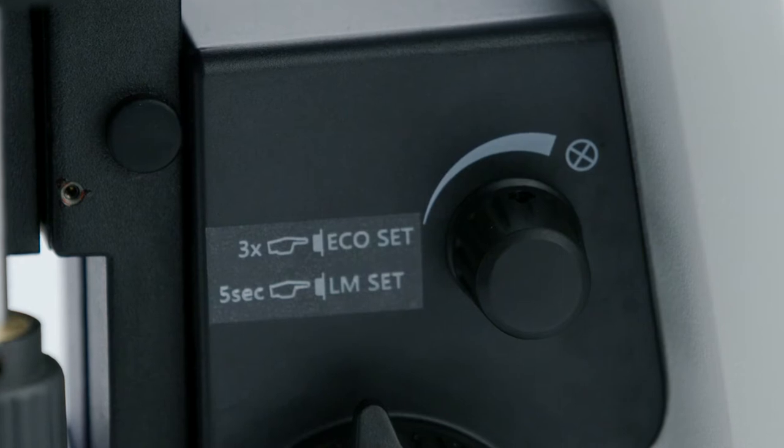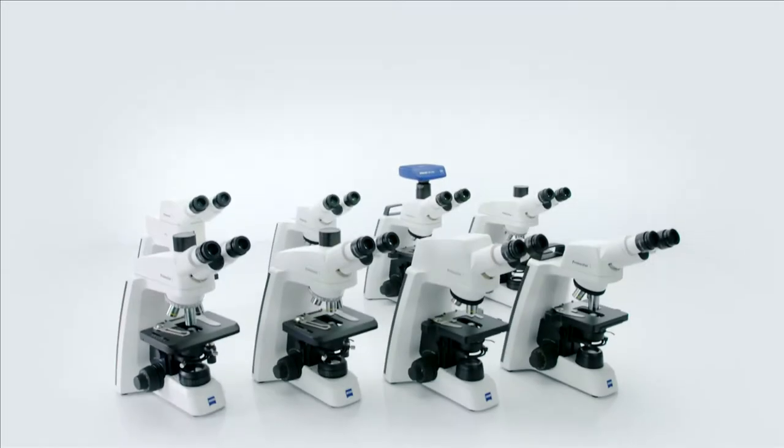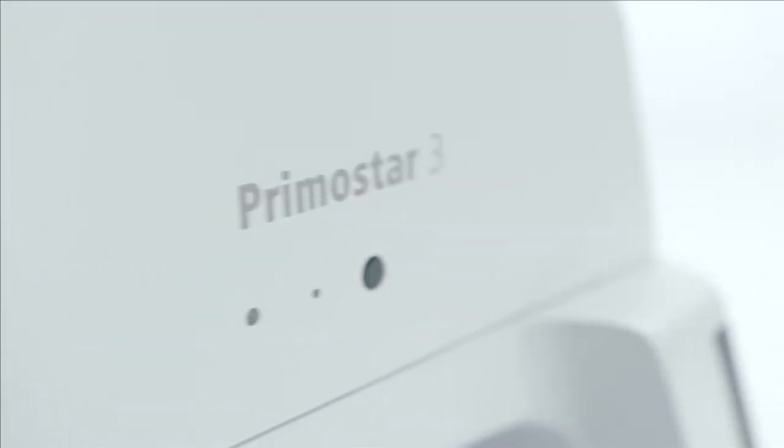Simply activate the Light Manager when changing lenses and the microscope will remember the precise amount of light set for each lens position. Here's how it works.